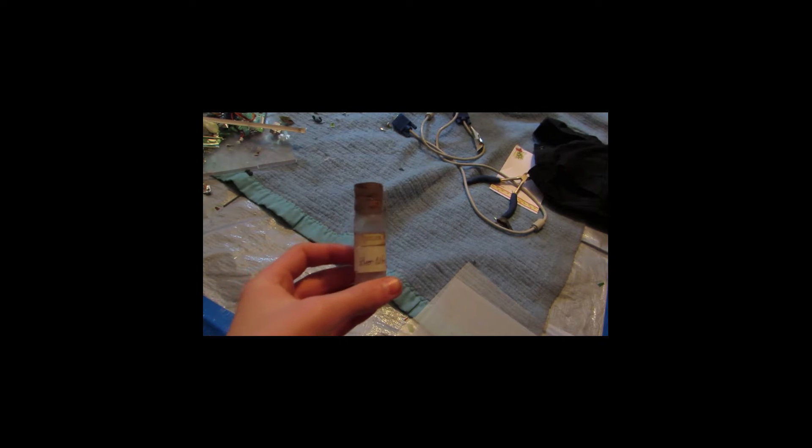Hey guys, and welcome back to How to Make Elements from Household Materials. Today's element will be silver, again.